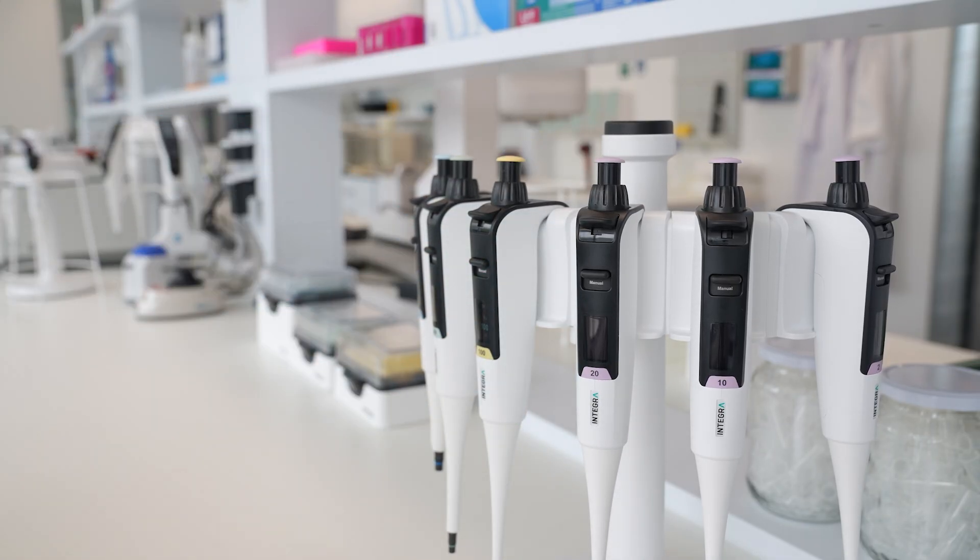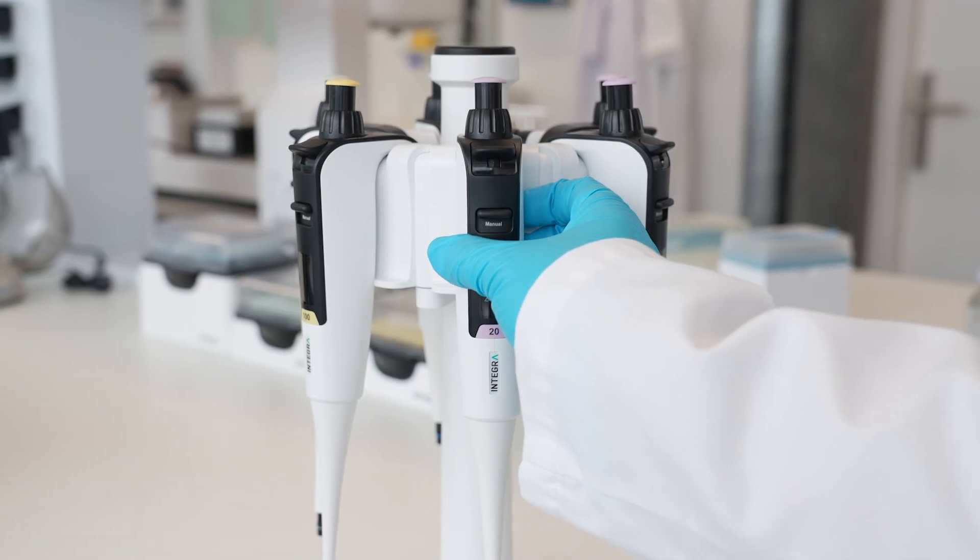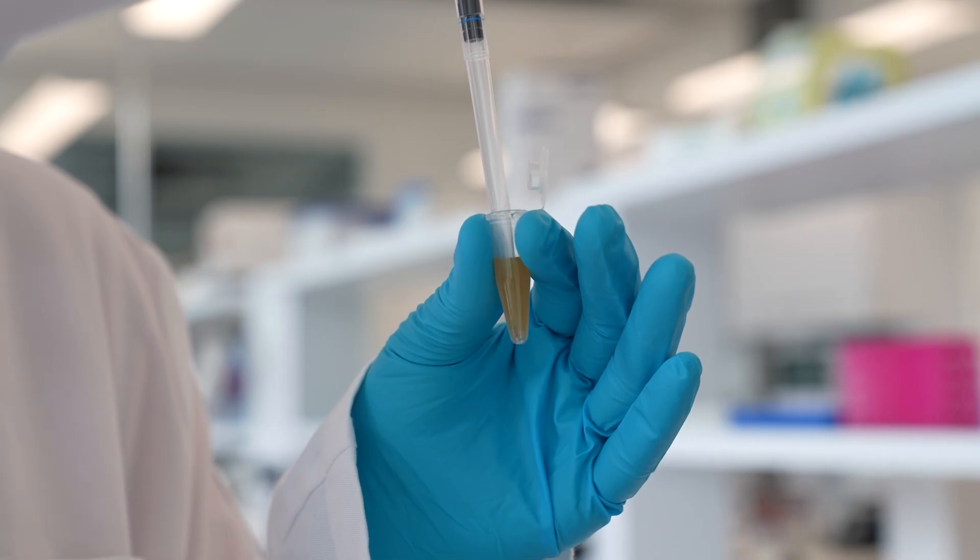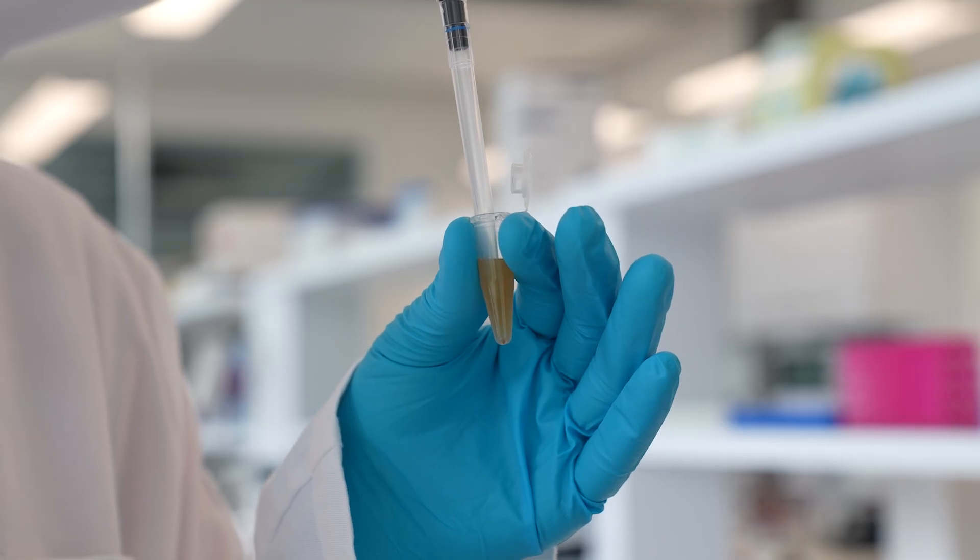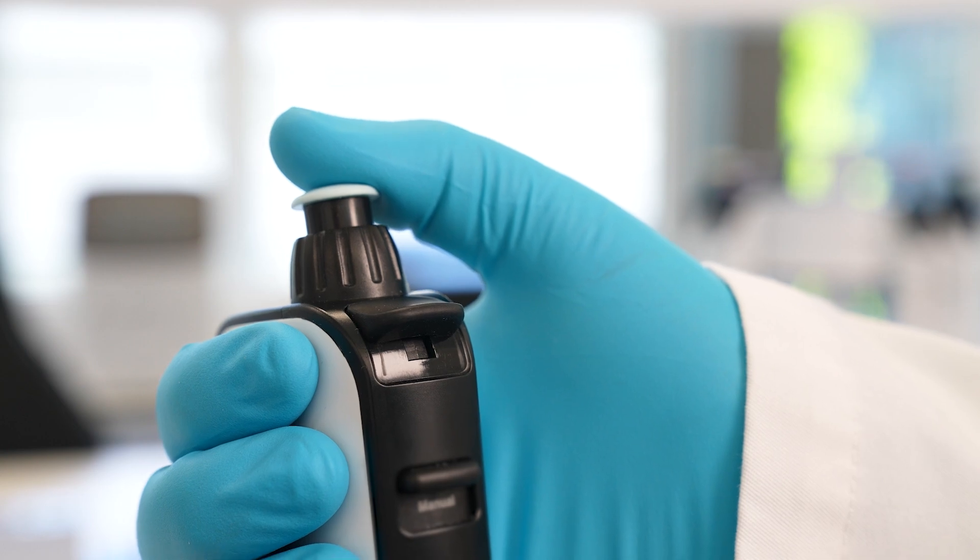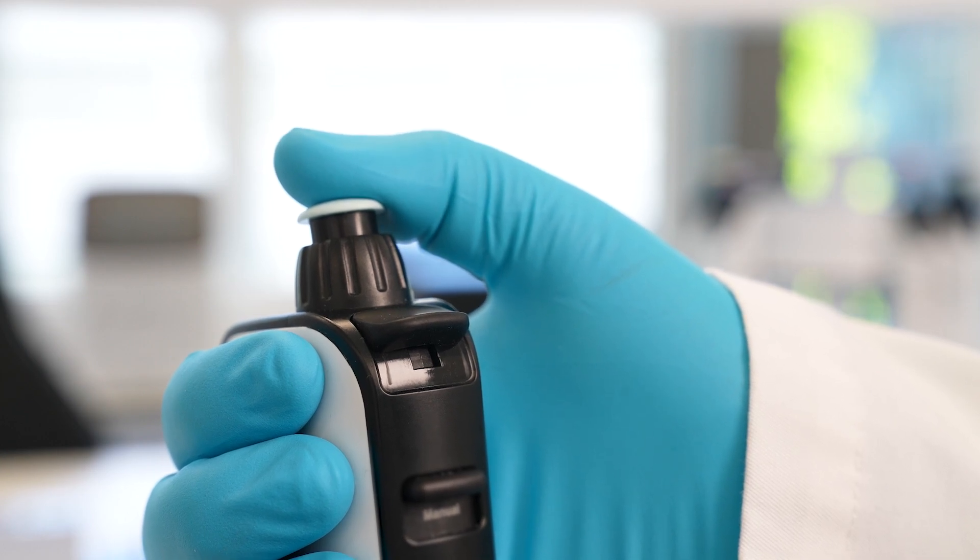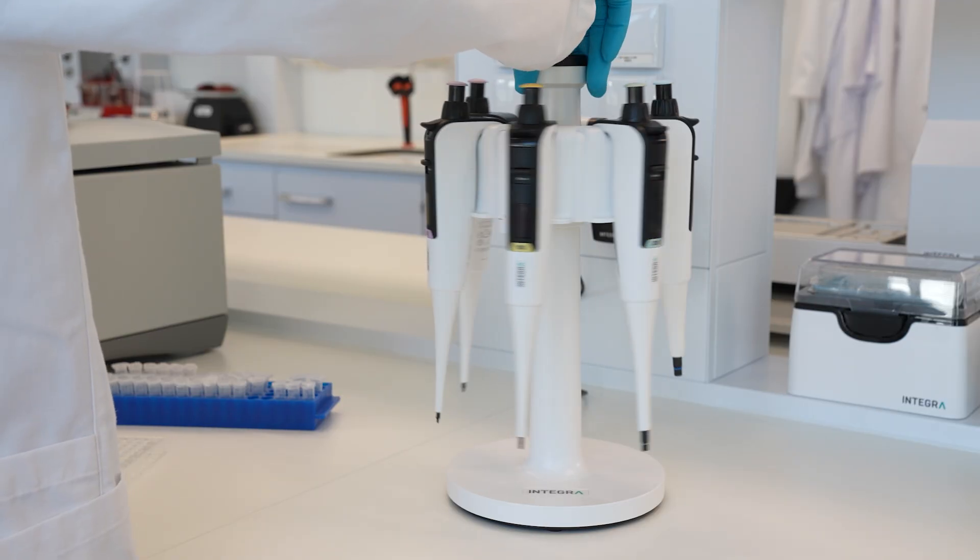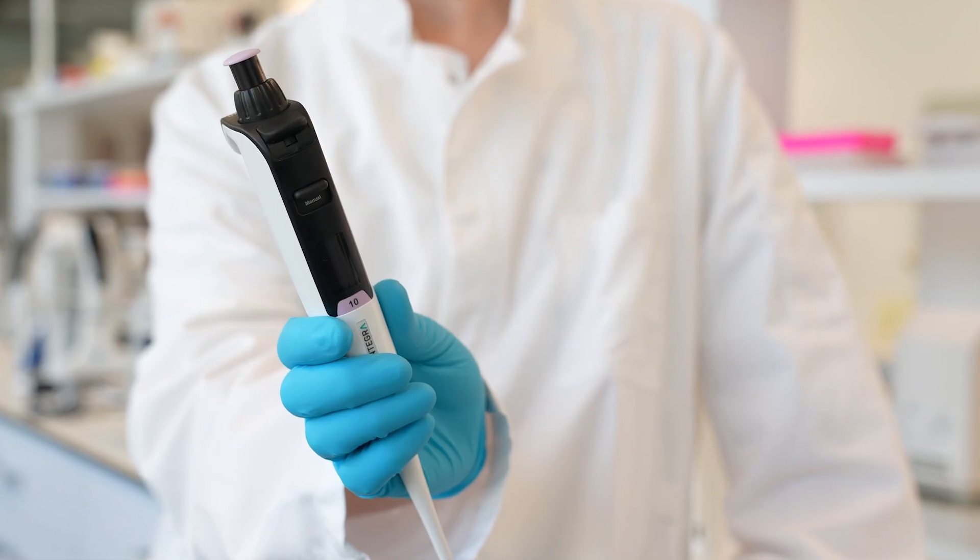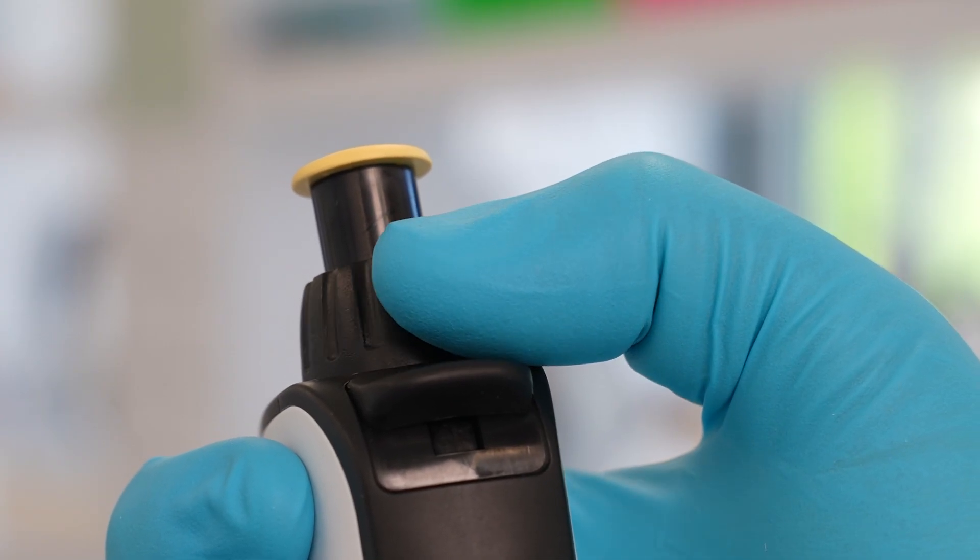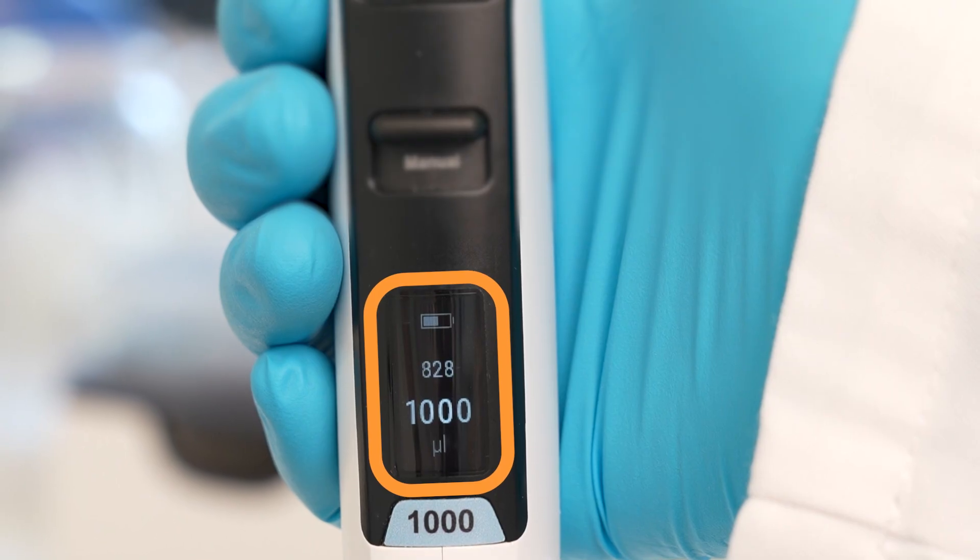With the Switch, manual pipetting is all about control and ergonomic comfort, especially when mixing liquids. The Switch has an exceptionally light plunger force and keeps your thumb happy with a perfectly positioned and consistent plunger for all volumes—something no other pipette can boast. One-handed volume adjustment and real-time measurement of liquid in the tip make this manual pipette simply unbeatable.